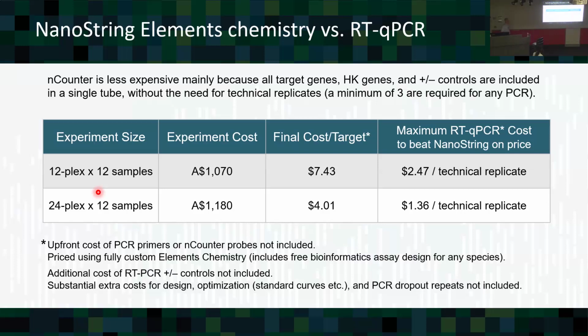Yeah, look, I've been through all of that pain. I have, and I worked for Corbett for a while. You might remember Corbett made thermal cyclers. I was their global marketing manager and everything. That was the rotational system. So it took away thermal variation because it just rotated the block at high speed. That was pretty cool. But the PCR is the PCR.